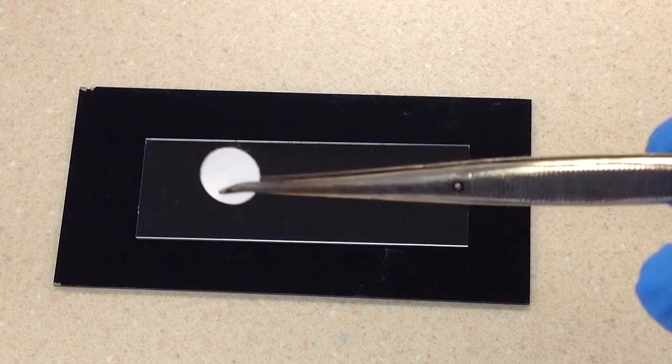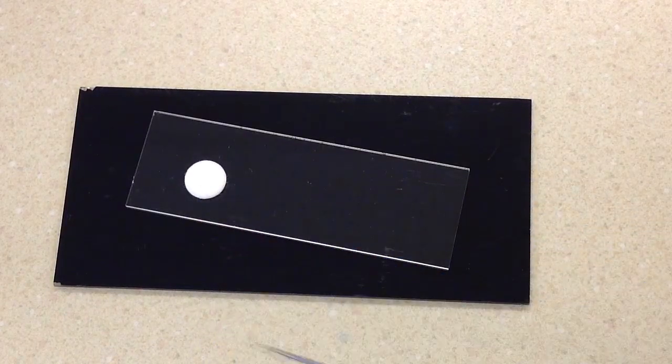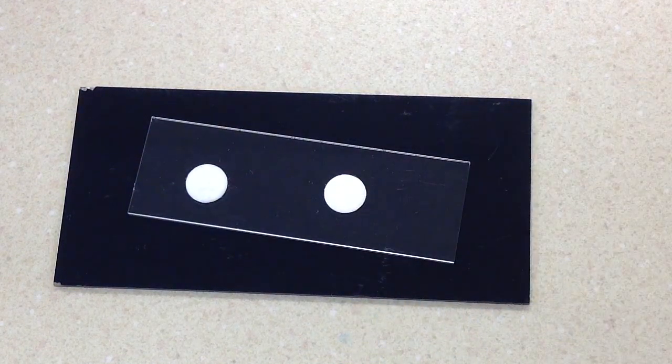The first thing we need to do is go ahead and take a couple of test disks out. Let me pull one out of the container here and show you what it looks like. That will be our positive, and that will be our negative.